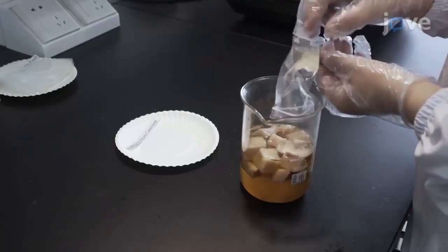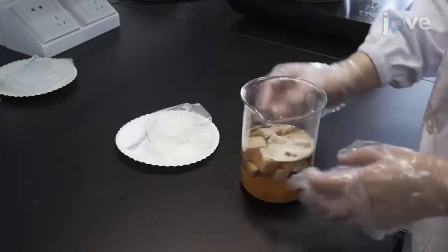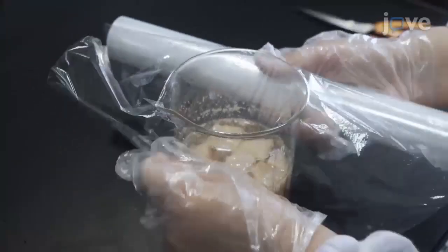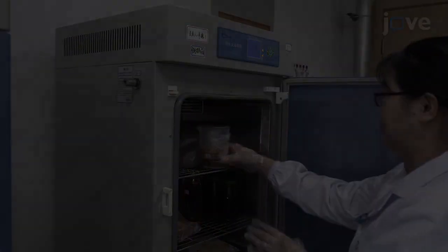After this, mix the dried fish cubes with the flavor solution, inoculating 0.4 to 1.6% Saccharomyces cerevisiae at a ratio of 1 to 1. Seal the mixture in a container and ferment at a temperature between 25 and 35 degrees Celsius for 6 to 10 hours.